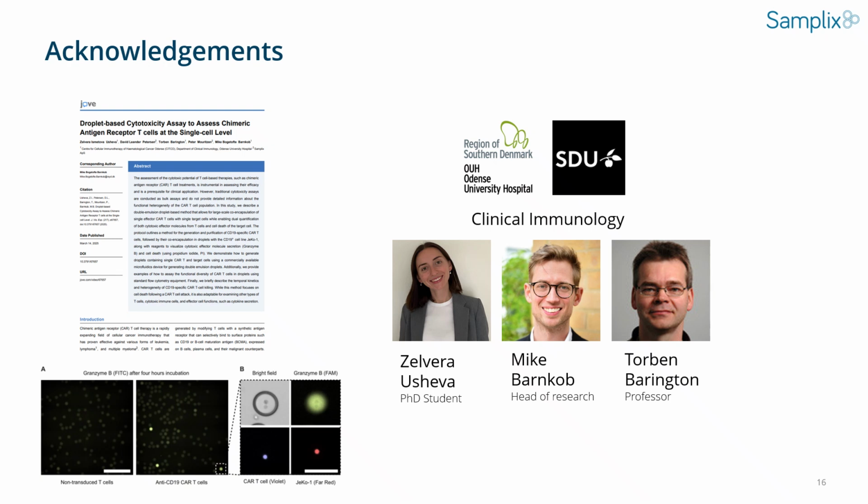I also want to highlight a paper that the team had out last year in JoVE, which is like a video paper, but there's also a written script. It's on the droplet-based cell cytotoxicity assays applied in CAR T cells.